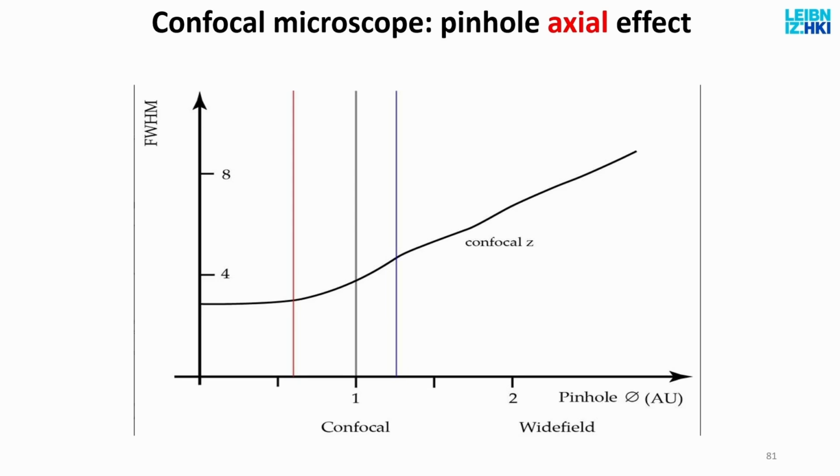So you put it wherever the curve shows you, but on the lateral resolution, you are in a different category completely because of the STED action. Otherwise, in terms of the light path, it's an addition to a confocal microscope. It's not a separate system. So the pinhole setting would reflect what the confocal system in general reflects, but laterally you are doing much better.